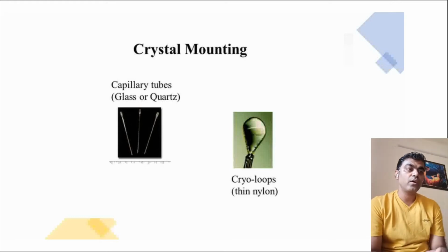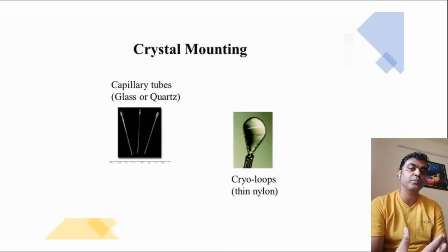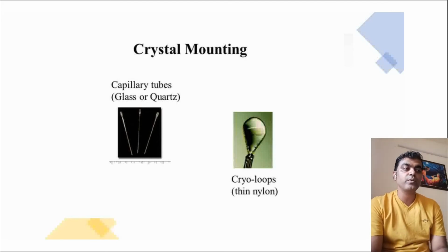We are manipulating the properties of X-rays to decipher structural details. But again, the crystal is very important, so crystallization of protein has to be done, and these are the methods of protein crystallization which you can achieve in your lab. Once you achieve a proper crystal, you can take it to your diffractometer and then study it. How you are going to study it, in terms of conformations, torsion angles and everything, I will take up in the next class.